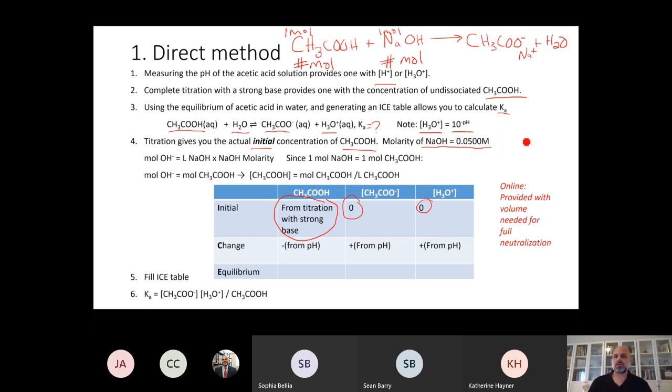And when we're doing a titration, the reason we want to do that is if you take your sodium hydroxide pellets, we can weigh them on a scale and get an actual quantity of the amount of sodium hydroxide we have. So when we dissolve that in a known volume, we can calculate an actual known concentration of sodium hydroxide, right? So that allows us to work backwards, right?